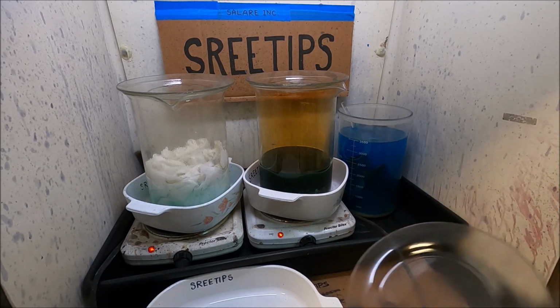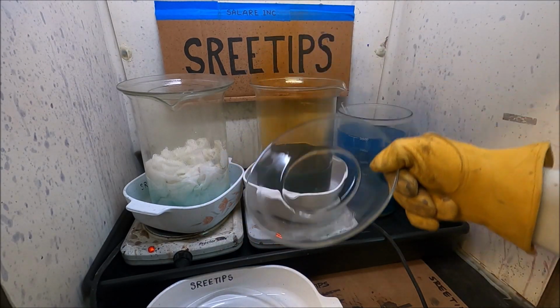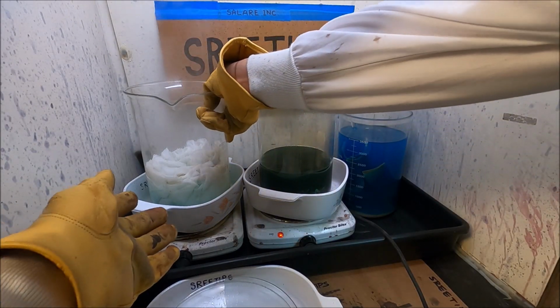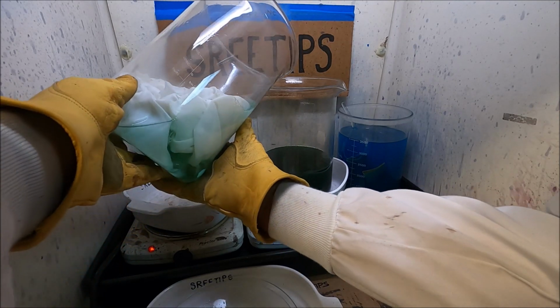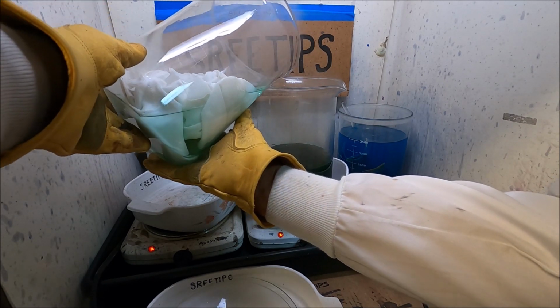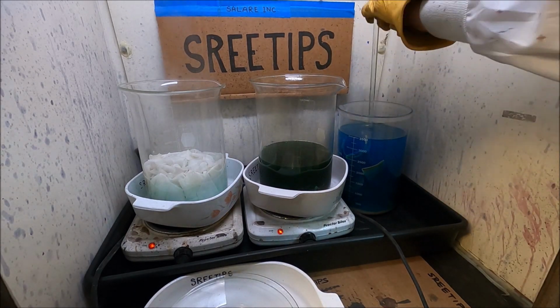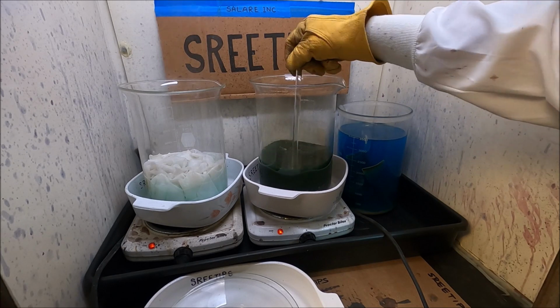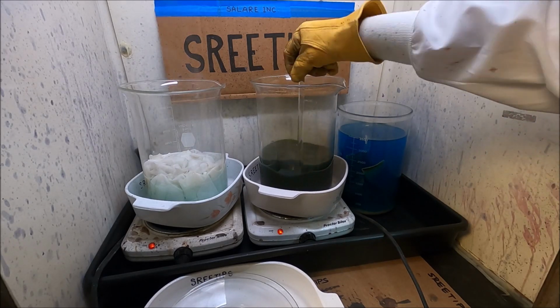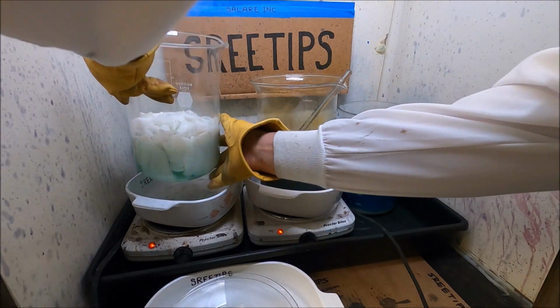And then over here, what we're going to do is add some of this hot boiling dilute nitric out of these filters into our solids in this big beaker here. I'm just going to pour this in carefully, a bit at a time, because I don't want the reaction to run away on me in here. I'll just keep adding dilute nitric to these solids over here until we get everything to go into solution.